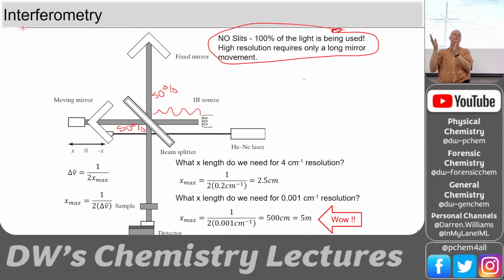That's just their technology, right? They figure it out. If we run this sputterer for 20 seconds, we get 50-50. 21 seconds, it's not. It's like 51-49. So they've perfected the way to make these beam splitters so that half the light is reflected, the other half goes through, statistically. So that's pretty nice. Then they hit these cube mirrors.